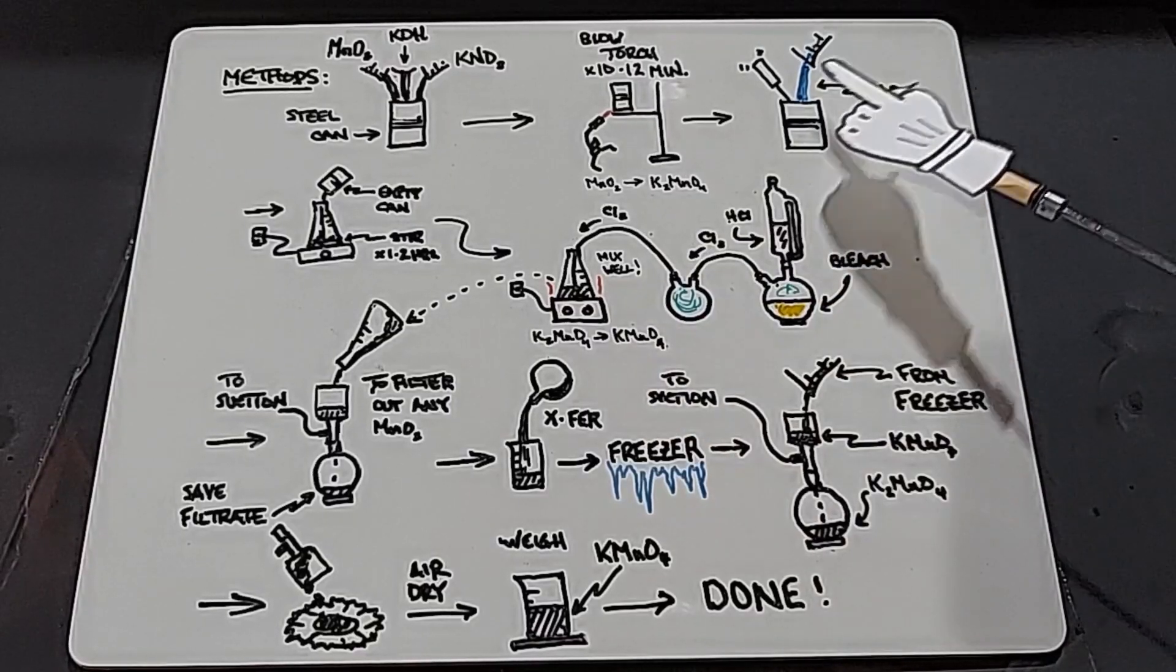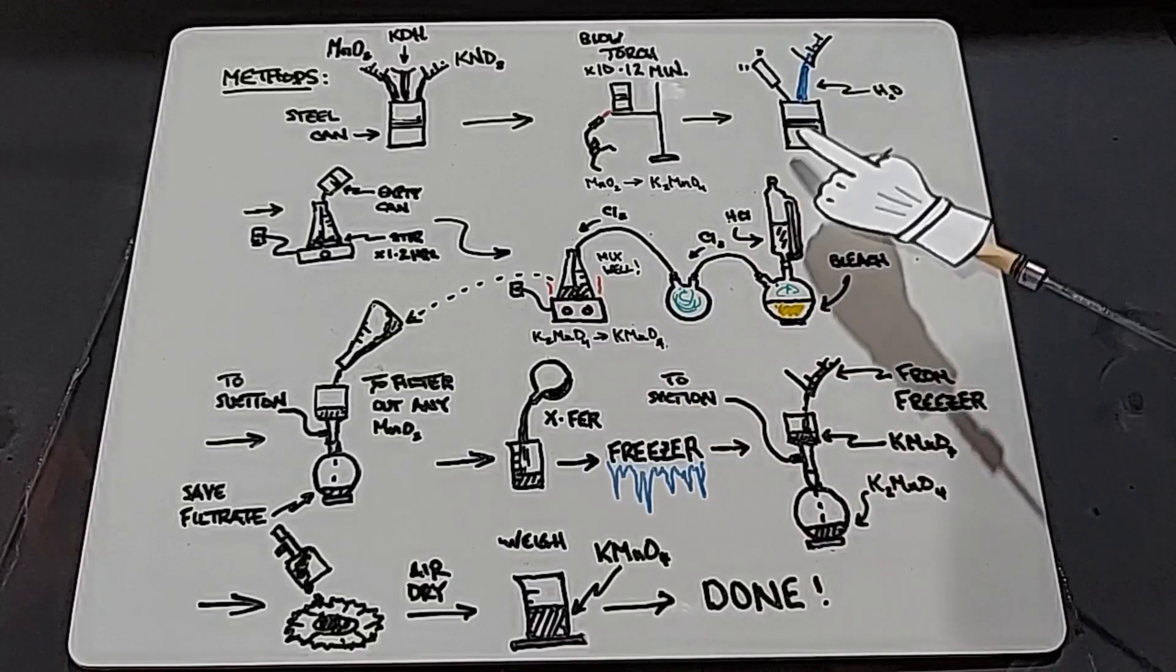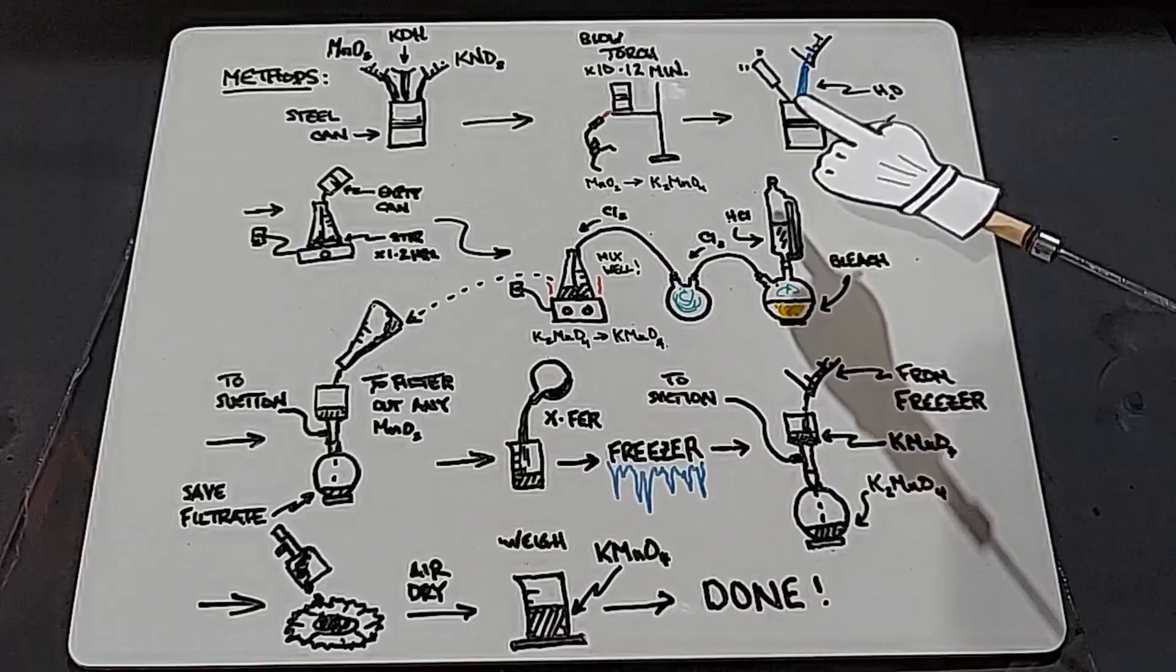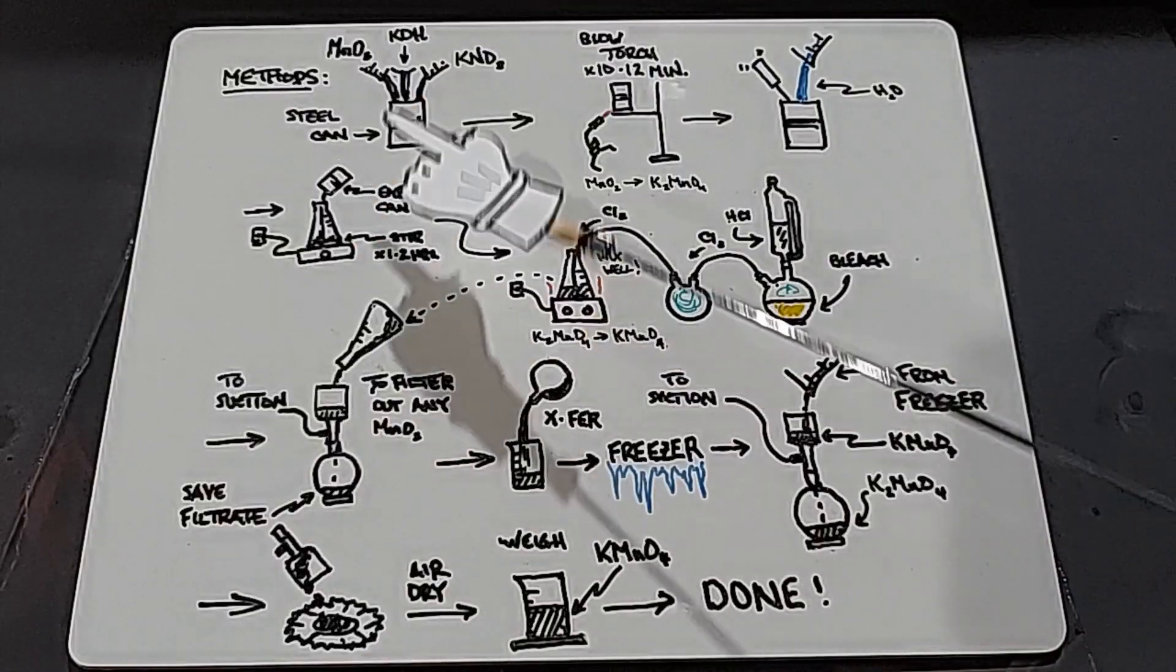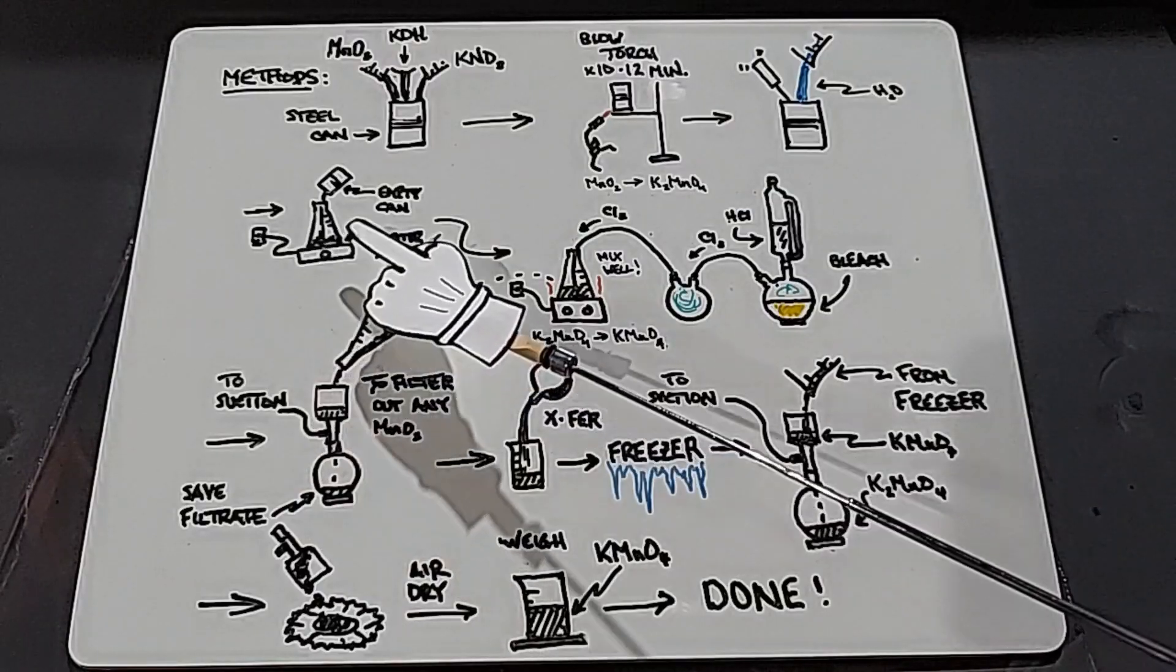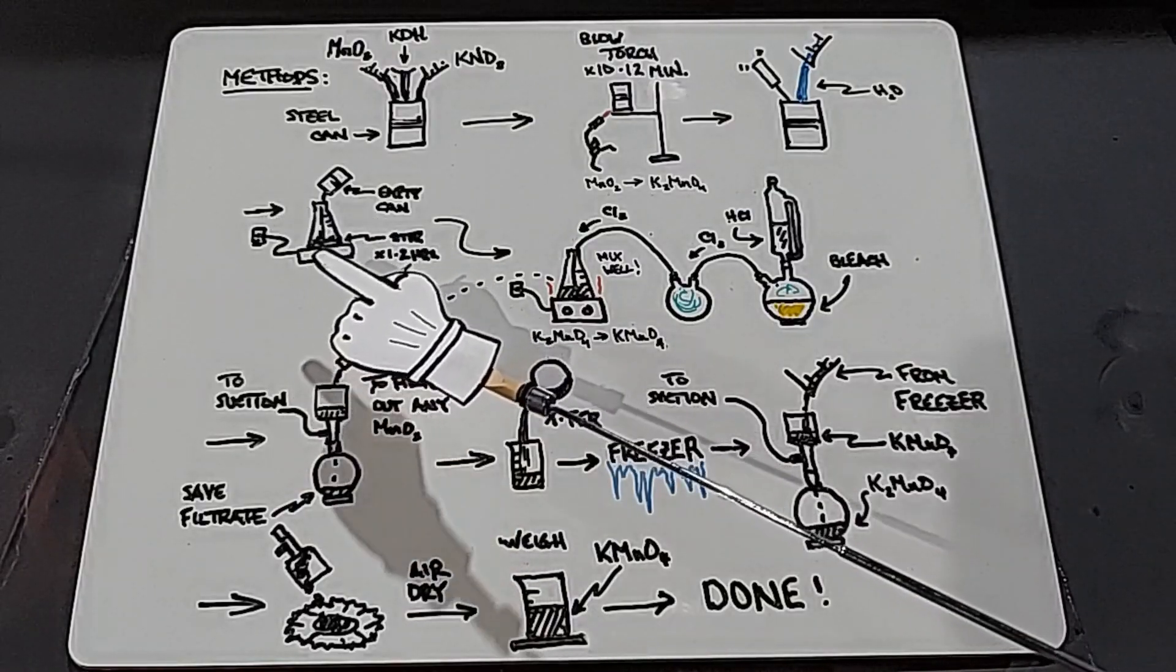Once we let the can cool down, we're going to add water and use a screwdriver or whatever to break up the chunks at the bottom because it's going to be a pretty hard chunk. Then we're going to put the contents into a flask and stir it for at least one to two hours to make sure everything is broken up really well.